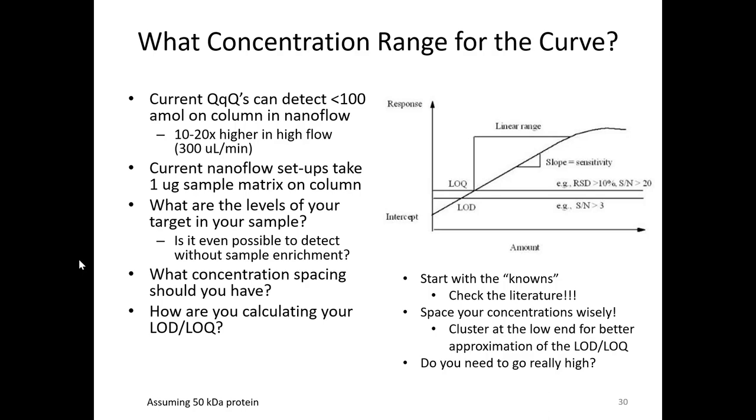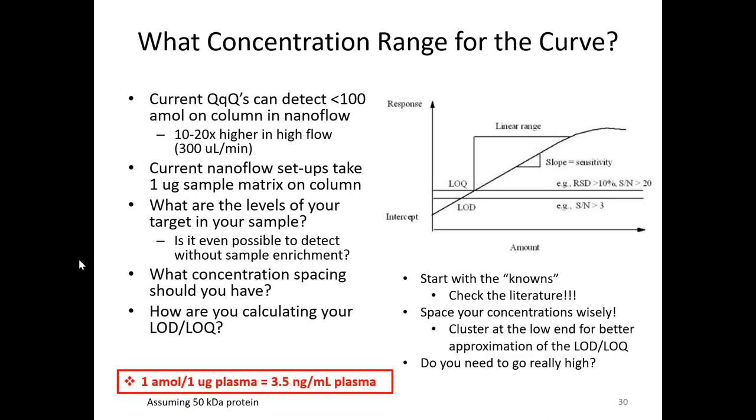And that's a very quick and dirty way of doing it. It tends to be around what you can get with more involved calculations, but it's not personally what I would recommend. I would try to evaluate it more statistically.